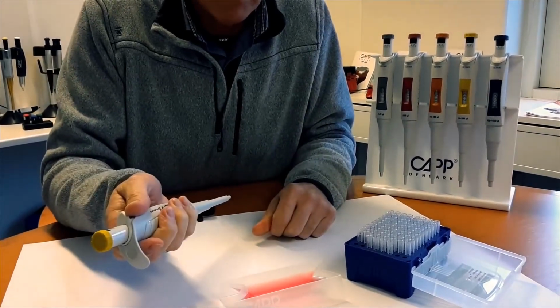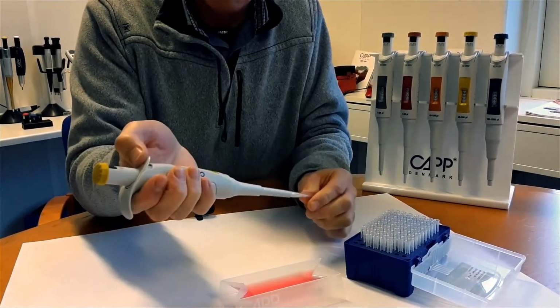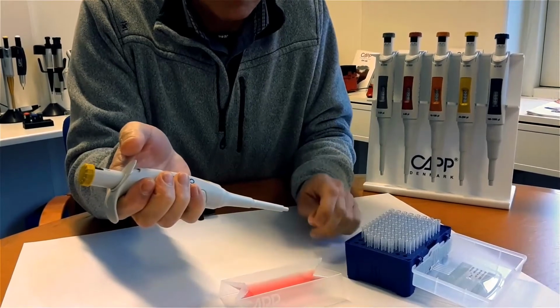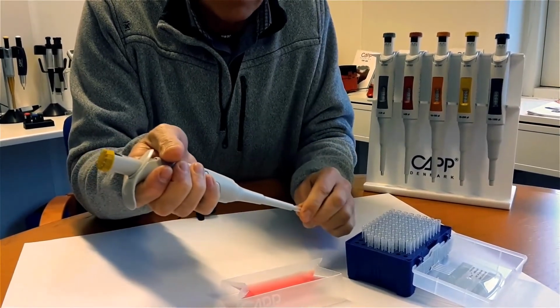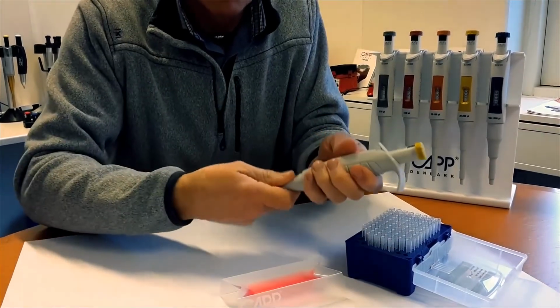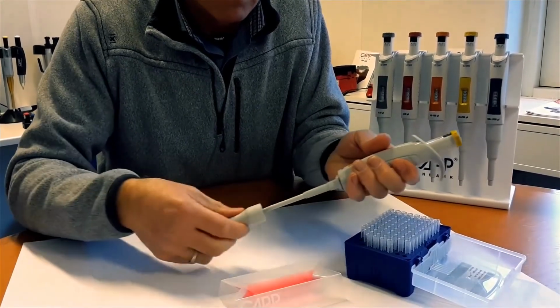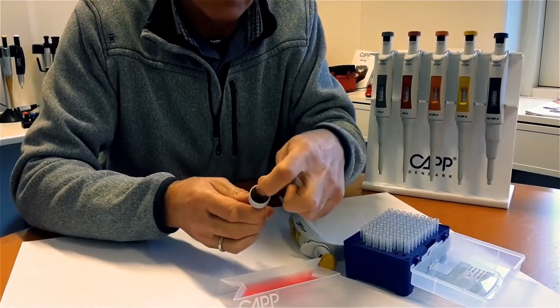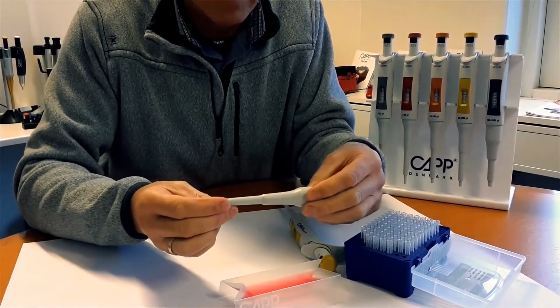Mount the pipette tip and press the tip ejector. Observe that the tip ejector is functioning smoothly. In case of any discrepancy, gently unscrew the tip ejector. Visually verify that the tip ejector thread is intact and check for any visual damages or signs of contamination.